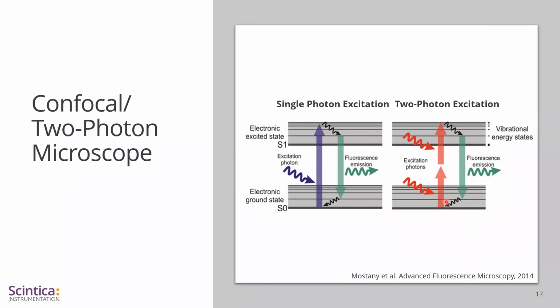In two-photon microscopy, reaching the excited state of an electron is achieved by the simultaneous absorption of two photons. The likelihood for this to happen is basically only reachable in the focal point of the laser beam, which is why there is no out-of-focus fluorescence from scattered photons, eliminating the need for a pinhole in the two-photon microscope. And since two low-energy photons with a long wavelength are used to create the energy needed to excite the fluorophore, the penetration depth will be higher.